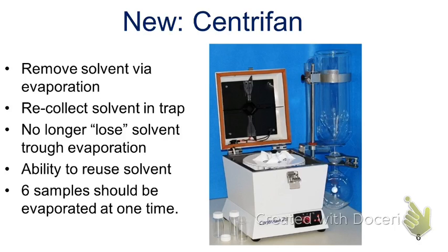Okay? So why even deal with special equipment? How could you typically evaporate solvent? It's the easiest way to do it. Just heat it up. So we could just put this on the hot plate and boil off our solvent. Okay? What's in general a bad reason for, or a bad idea? Why is that a bad idea? Let's try that.